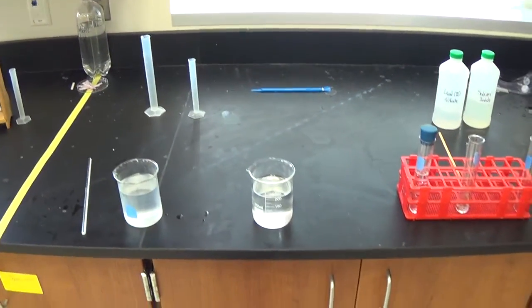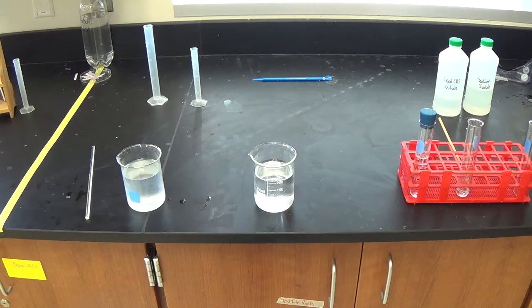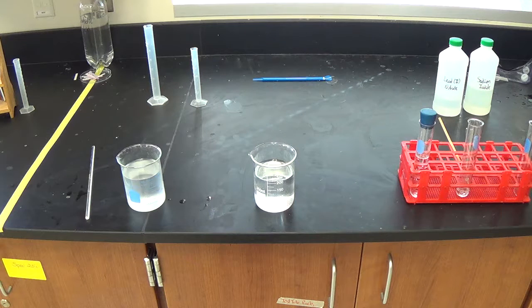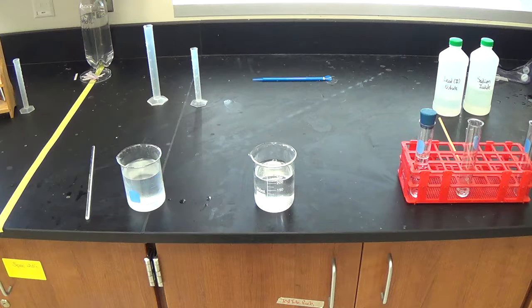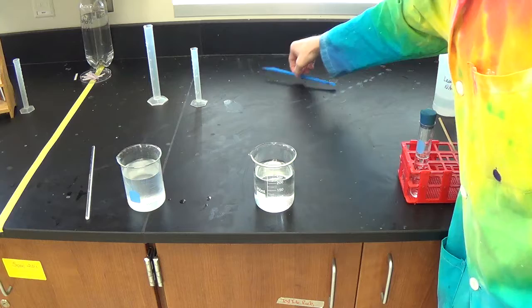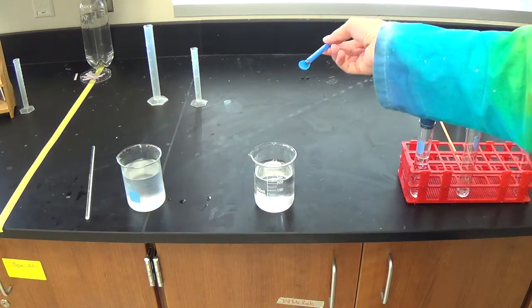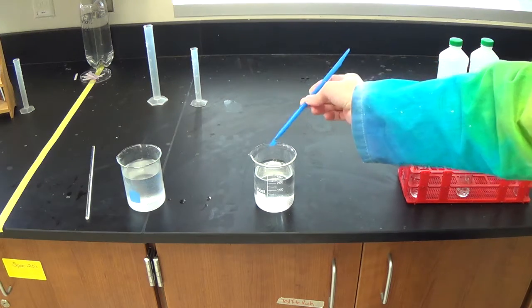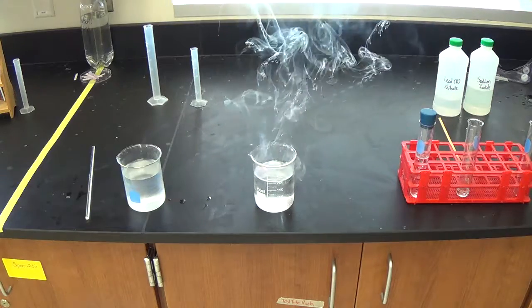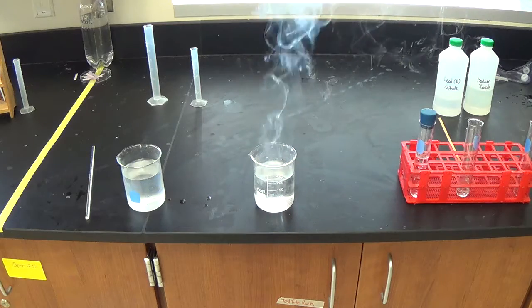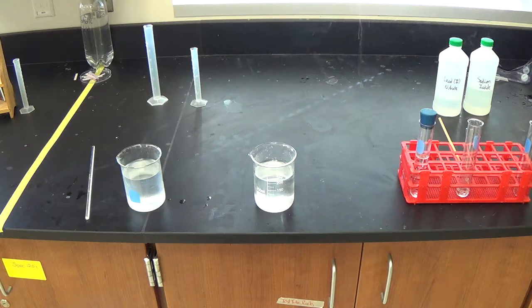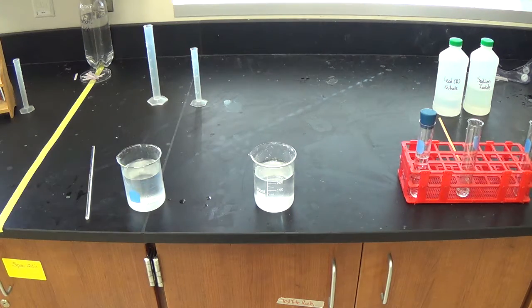We're going to do Reaction 2 now. Very similar. I still have a beaker of water, but now I'm going to use potassium. I'm not going to test with litmus paper because potassium is in the same chemical family as sodium. Elements in the same chemical family behave in a similar manner. In testing the potassium, I'd get the same results for the water before and after. It will change what you write on your lab analysis for the reaction. But we're still going to end up with a gas and a base and we still started with neutral water. Here's the potassium I'm going to add in. Still making a gas. This time the reaction is energetic enough the gas caught on fire. Still moved around the beaker. If I were to test that water now, I would see it's a base. That is Reaction 2.